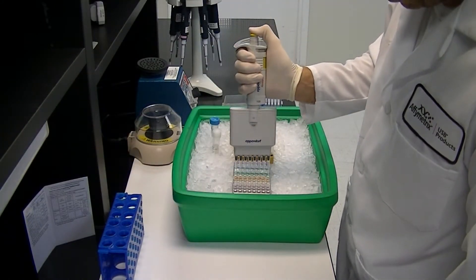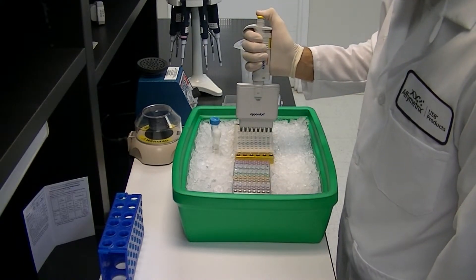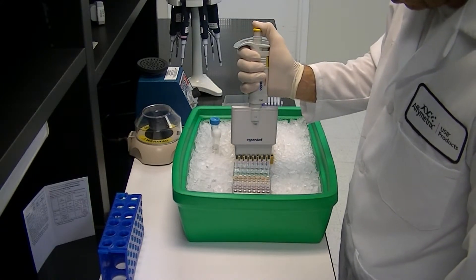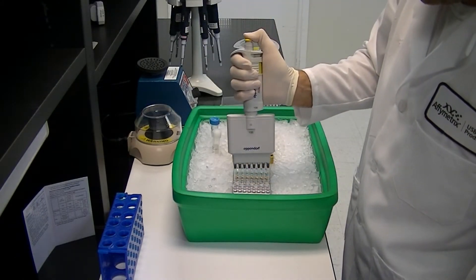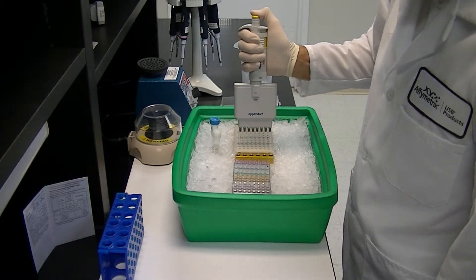The qPCR cocktails are then added in triplicate to the 96-well plate using a multi-channel pipette. Next, the sample dilution series is added to the wells with a multi-channel pipette, changing tips between each column.